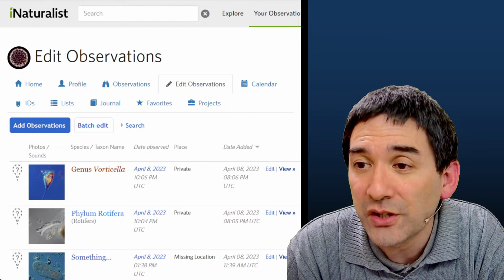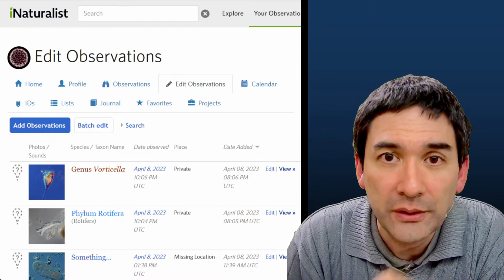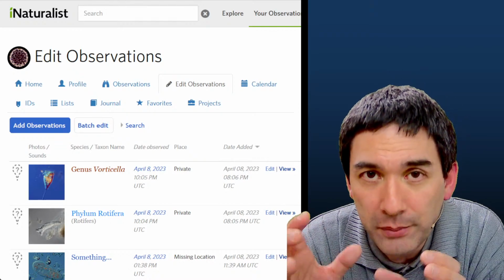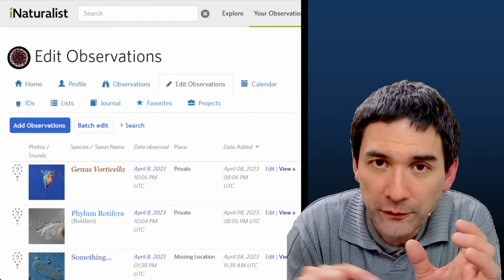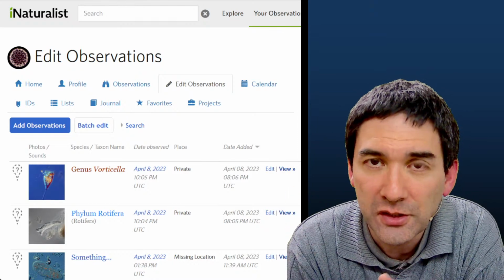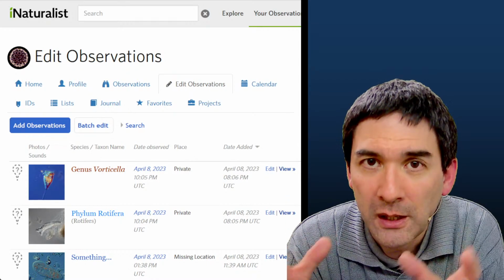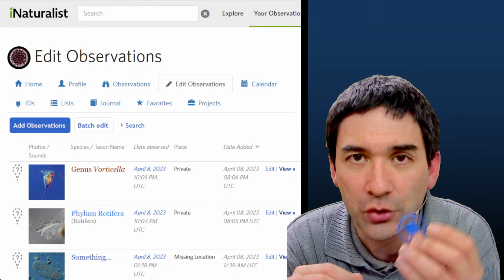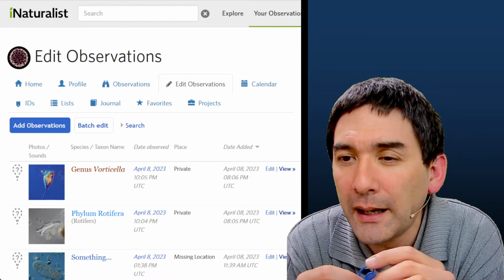There are special condensers available for dark field. The special dark field condensers that some companies offer, essentially they sometimes have built-in illumination, or they have some kind of rounded mirrors which make sure that the light bounces off, so you have a much higher intensity. Okay, so those dark field condensers actually are yet better than just using a patch stop, but not all companies have those. But the patch stop should actually work with pretty much any microscope. Yeah, and it might be actually good enough for most cases. Yeah. The garbage from packaging, cartons, and styrofoam.